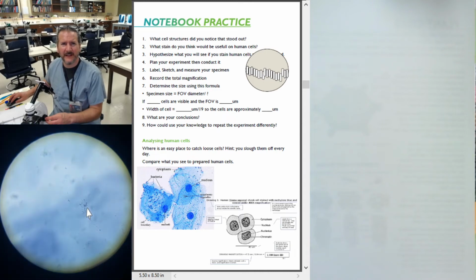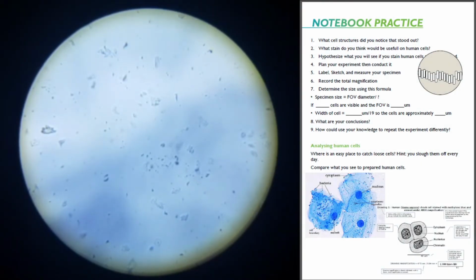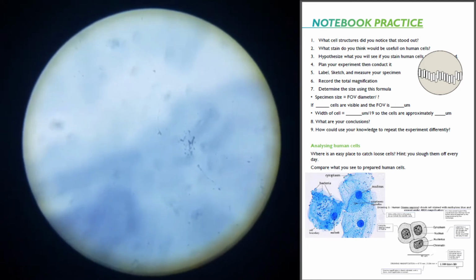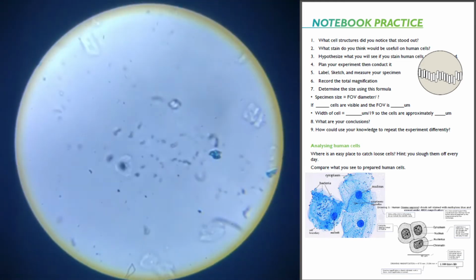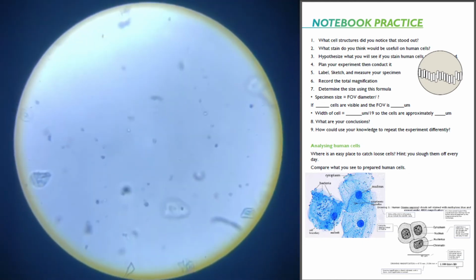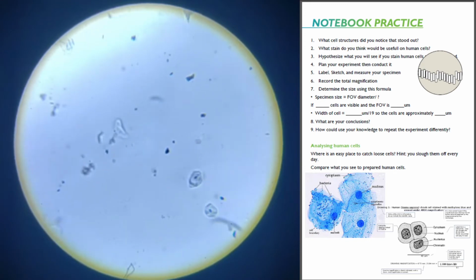Let's see if we can figure out what that is right there. Might be just a little of my lunch. Oop. Bring it in. Nope. Just some debris, a little lunch. Those cells.